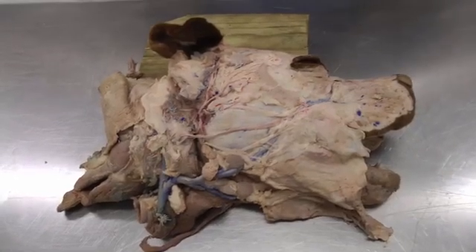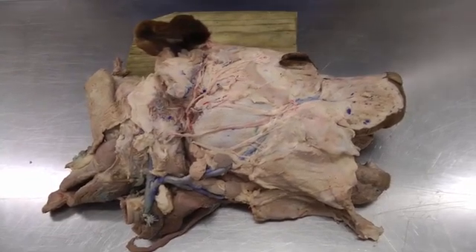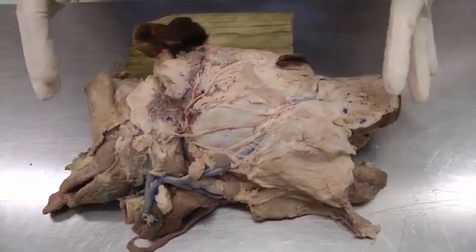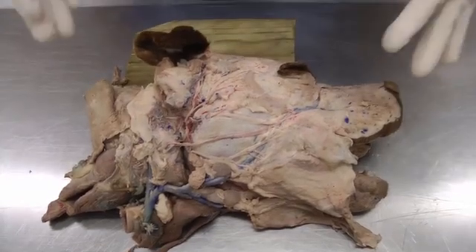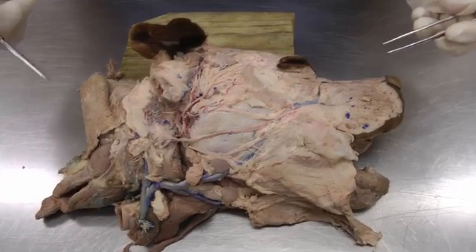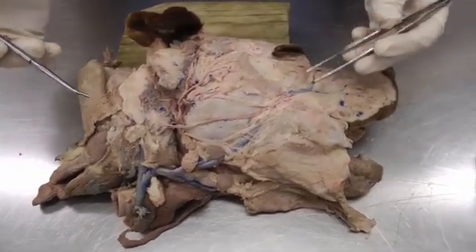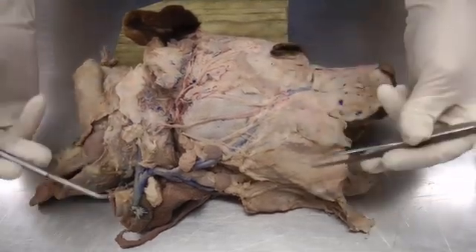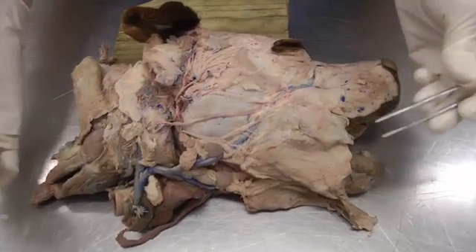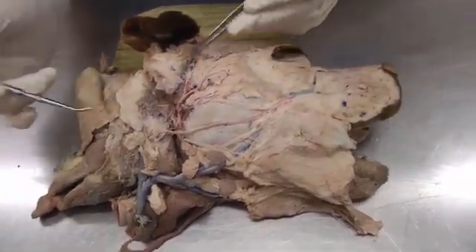This is lab 25 on the dog specimen. Here we're working on some nerves on the head and we're on the right side. We're going to be going back and forth between the right side and the left side, so there will be a lot of switching. If you have something that's better on one side versus the other, try and look at it there. There'll also be a lot of going back and forth between medial, lateral, and ventral.